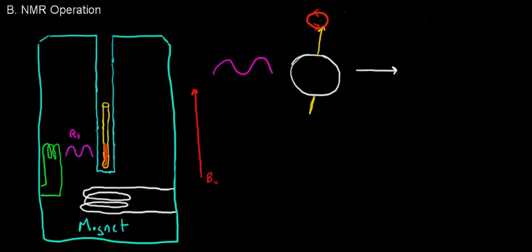That means that the magnetic moment is no longer aligned with the magnetic field, but it's now oriented perpendicular to the magnetic field. It's no longer roughly parallel, precessing, it's now perpendicular to the magnetic field. And so to summarize again, when the RF radiation is in resonance with the precessional frequency, the Larmor frequency of the aligned nuclei in the magnetic field, those nuclei, and these are the lower energy nuclei, will absorb that RF radiation, causing the magnetic moment to tilt on its axis, like so.